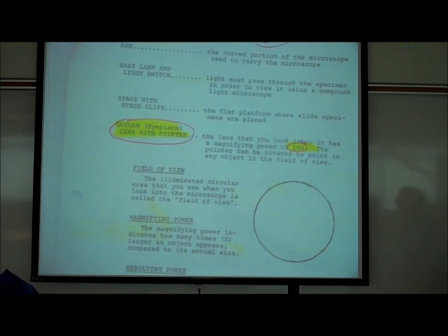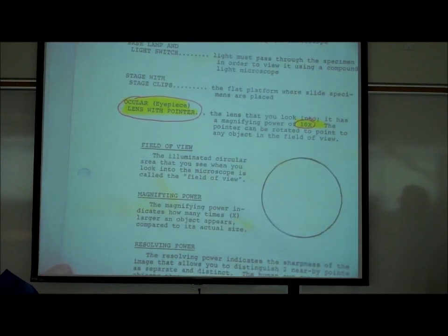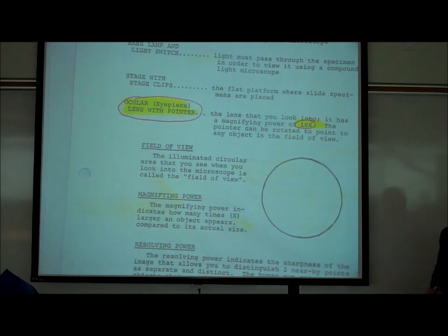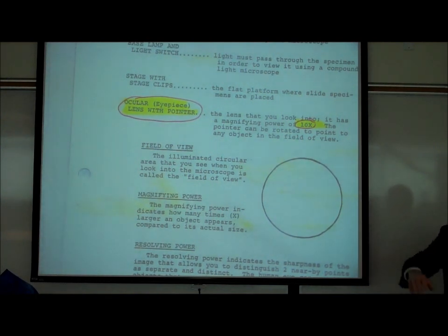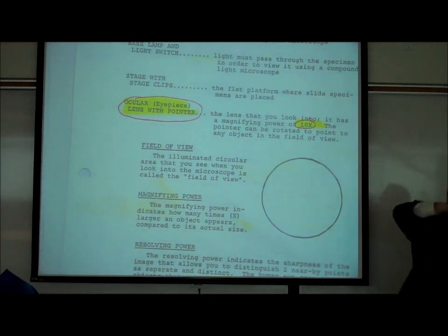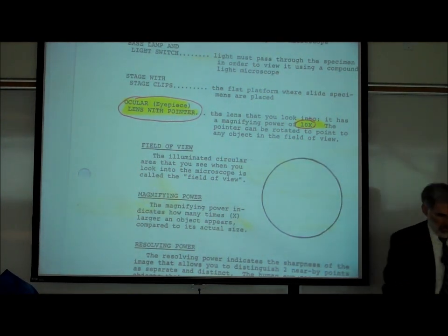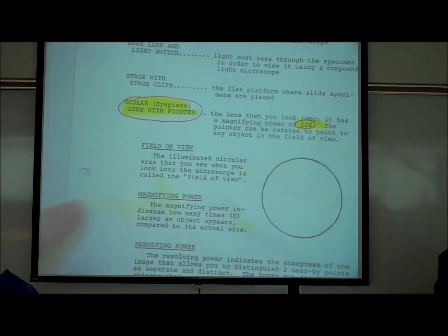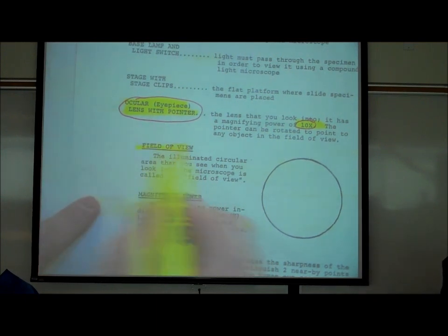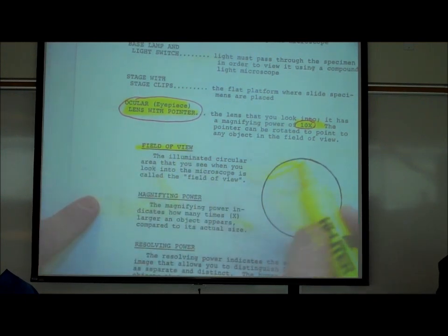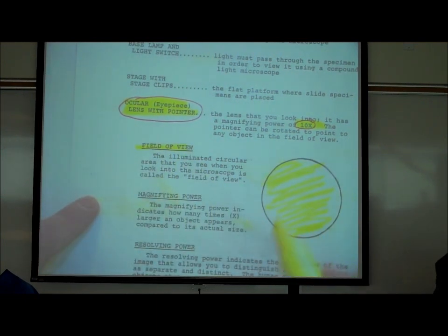When you look through the microscope, you'll see a circular area that is lit up — illuminated. That's called the field of view. It's the circular thing that is lit up.